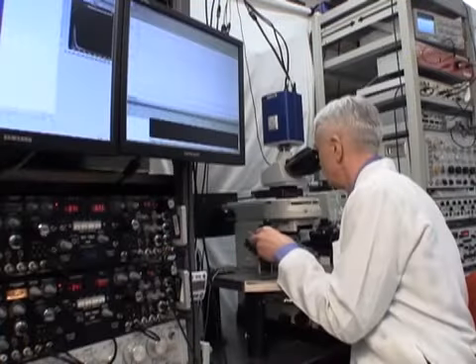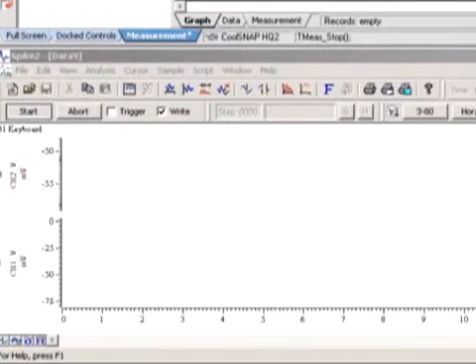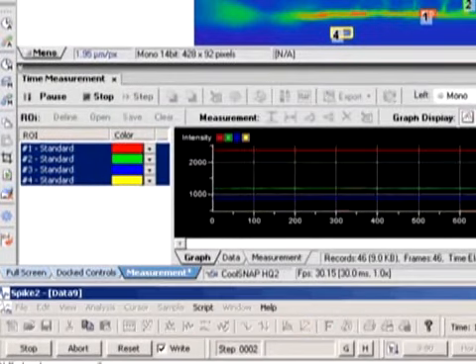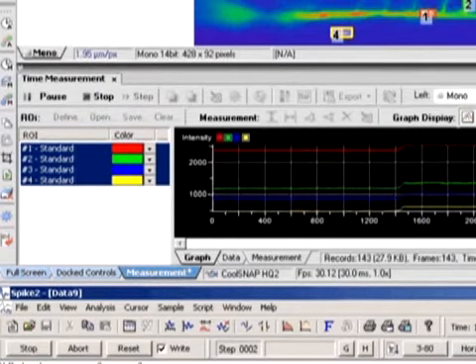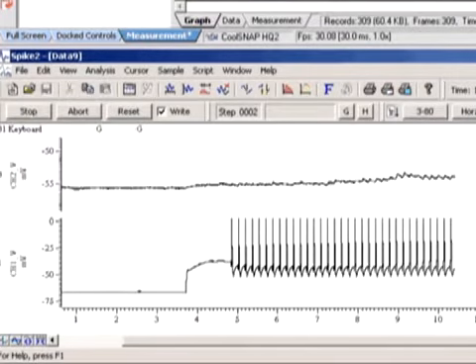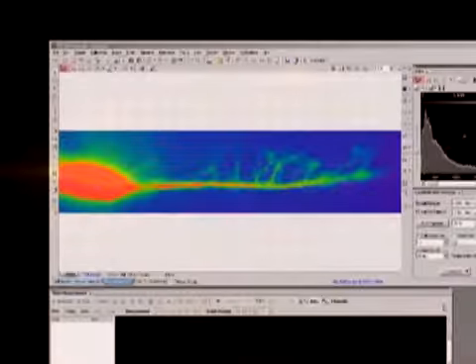During a typical experiment, you trigger action potentials in the presynaptic neuron by injection of brief current pulses. In this example, we show a burst of spikes and corresponding increases in the calcium signal. To test specific hypotheses, the calcium signal can be manipulated and effects on synaptic transmission determined. For example, drugs such as the calcium chelator EGTA can be presynaptically injected or applied through the perfusion system.